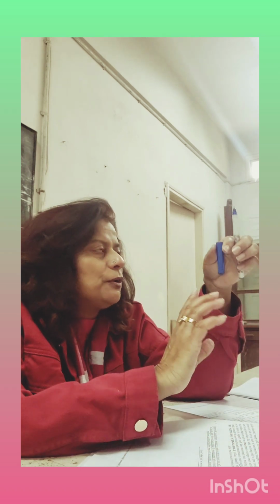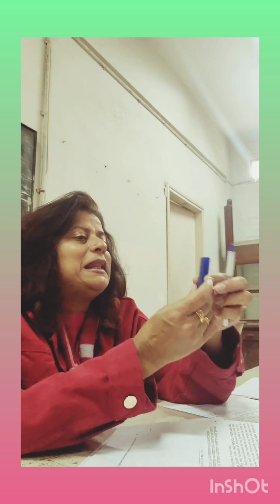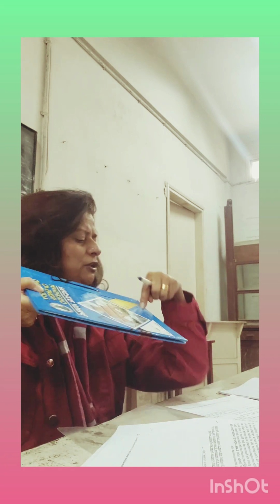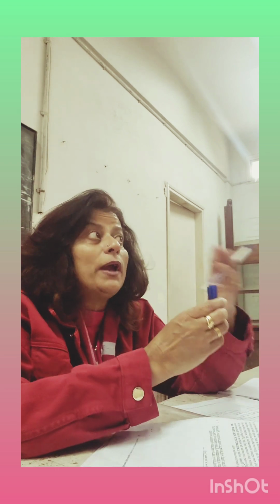Now after going through the steps, you are going to observe your test tube that has all the reaction products in it. Your color becomes Prussian blue coloration, because acetanilide has nitrogen in it, it's a nitrogen compound, so it's going to give you a blue color. Yesterday the group did it, they got this color. It could be a bit lighter in shade, as for example the blue color of your journal that they showed me. It could be this bluish, lightish blue. It depends how much nitrogen content is there, right? And the way you have performed your experiment.